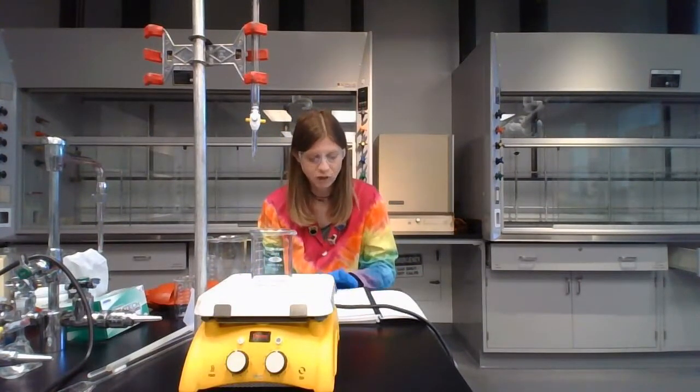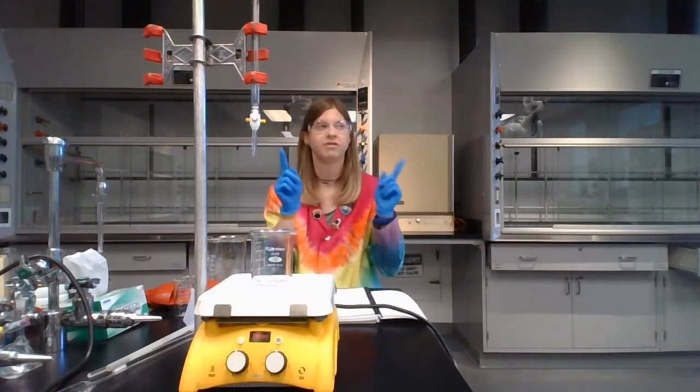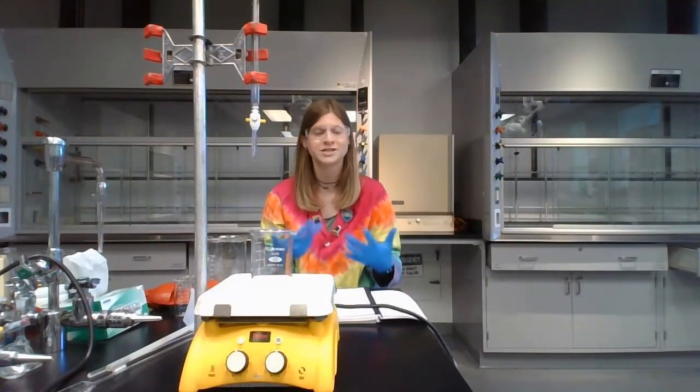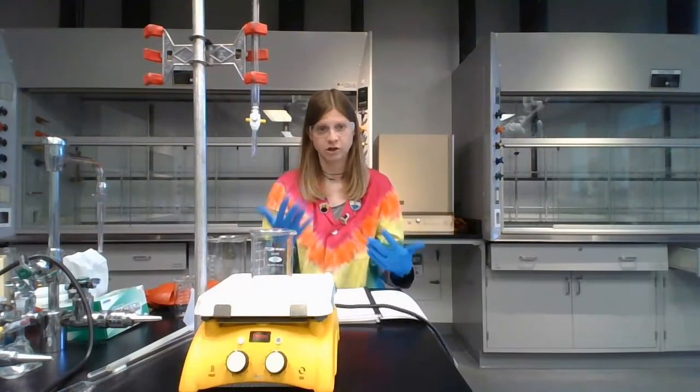Okay, so we will have the fume hoods on. We will have the snorkels on to keep the air circulating, so that any bad vapors, which don't have a scent, or anything that spills, is constantly being taken away during this lab.